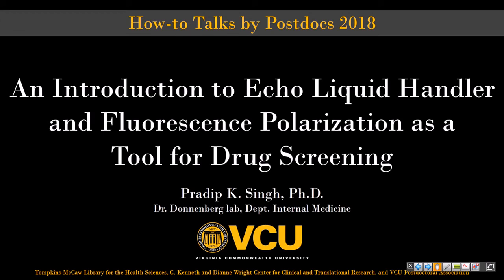But it's my pleasure to introduce Dr. Pradip Singh this morning. He is here at VCU in Dr. Michael Donnenberg's lab. He got his Ph.D. from the Institute of Microbial Technology in Chandigarh, India, and has been working here at VCU for almost 2 years, a year and a half to 2 years. He's going to talk to us this morning about the Echo liquid handler and fluorescence polarization as a tool for drug screening.